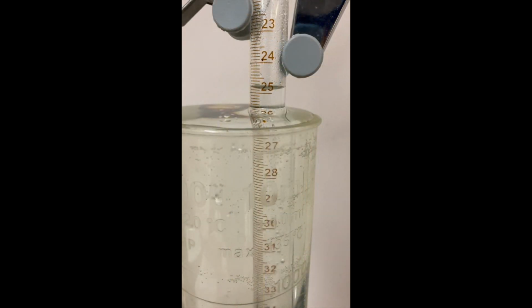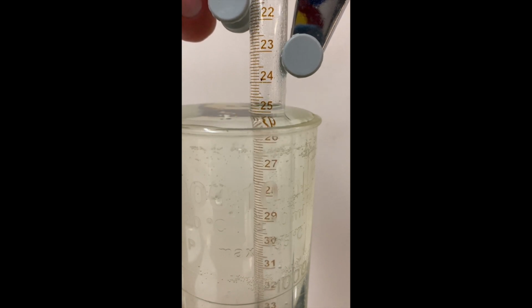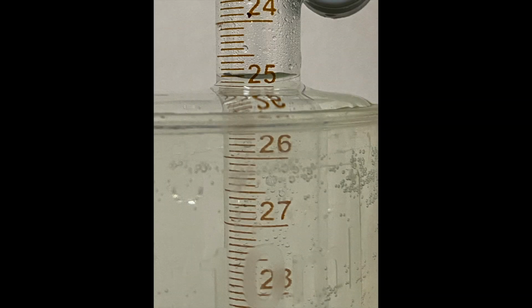Our eudiometers measure in milliliters, so you can see the water level right now. I'm going to lower it just a tiny bit further so that the two water levels are equal, and then we can take a measurement. Looking at the picture, what volume of hydrogen gas did we collect?